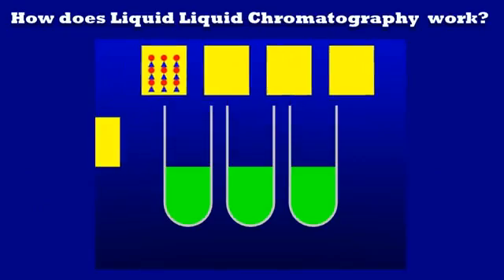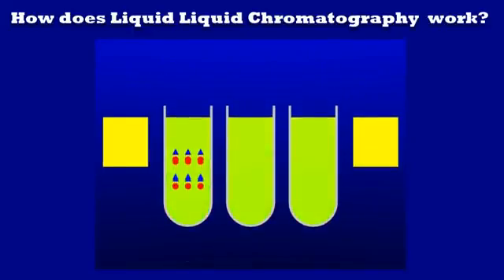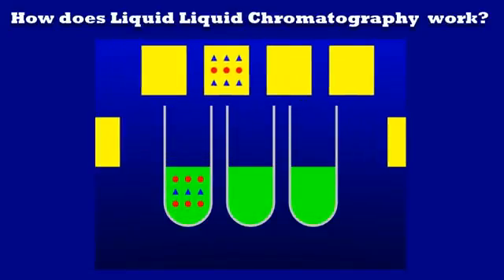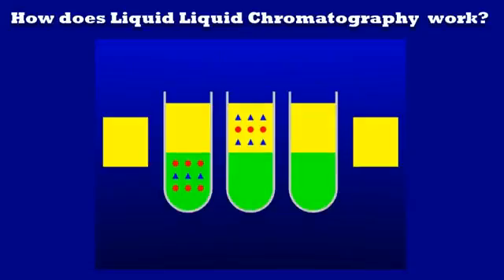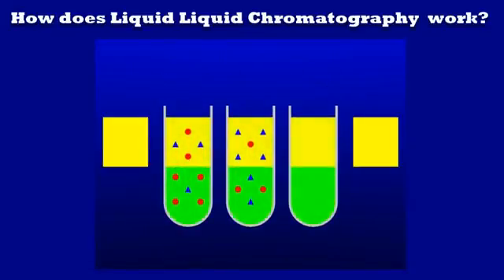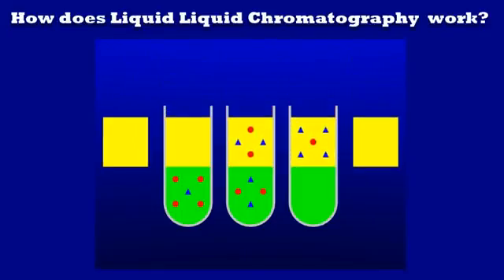The mechanism of separation, partitioning, is shown by this simple test tube model. This demonstrates that with the correct selection of solvent system, different solutes are retained at differing rates due to the solutes' partition coefficient in the solvent system. Only small differences in partition coefficients are required to enable high resolution separations.